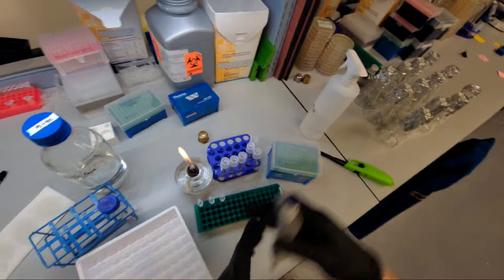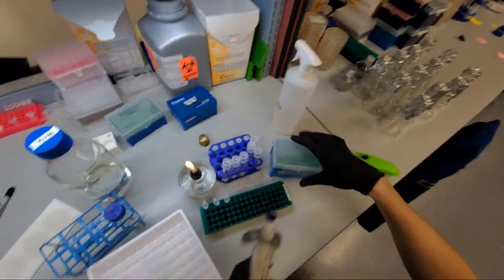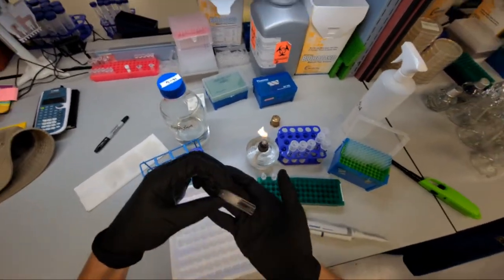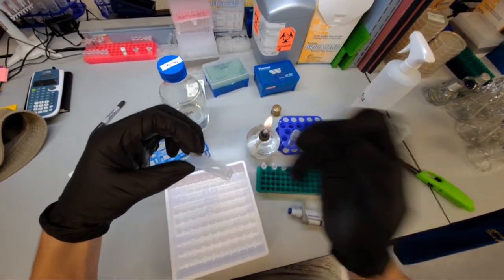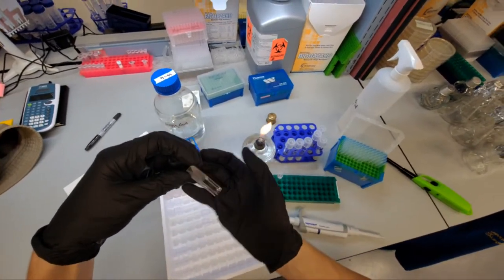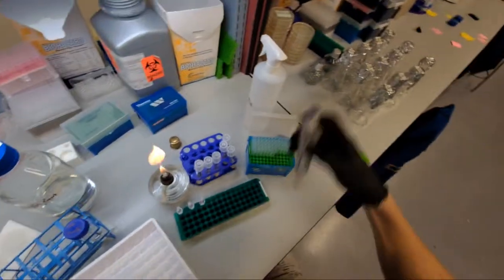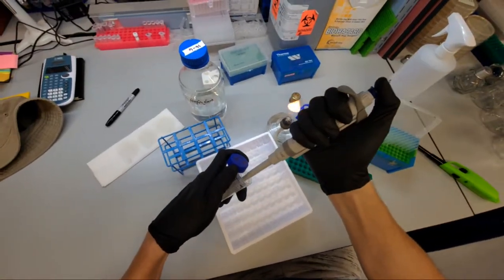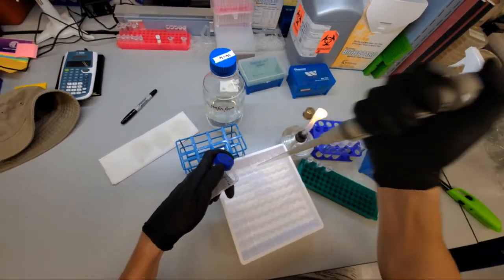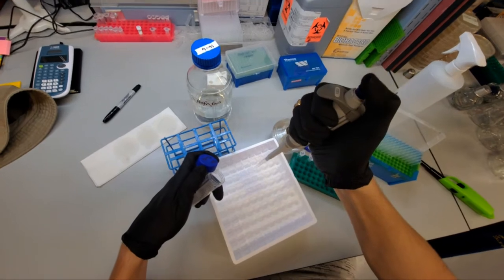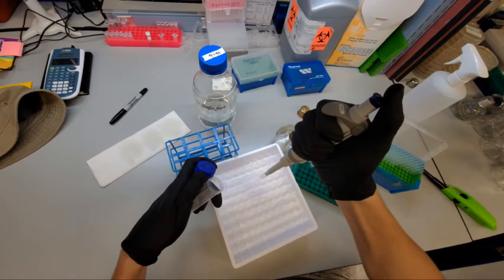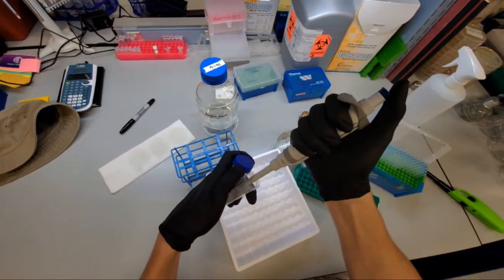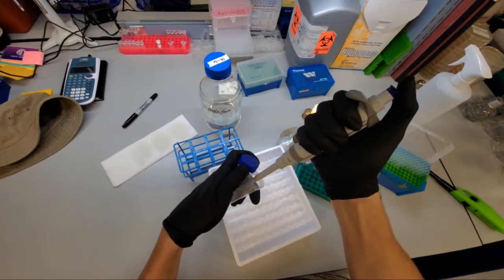So I'm going to set this pipette to 950 microliters, spray it down with ethanol again. And I'm going to fill each of these cuvettes with 950 microliters. So this is a cuvette. I've got videos on this as well. But the light shines through this way. And there's a detector on the other side that measures how much light gets through the cuvette. So the spectrophotometer is what it's called. It measures the light that gets through the cuvette, but it has a pretty limited detection range. So if you have too many cells, it will just give you a high reading and it won't be accurate.